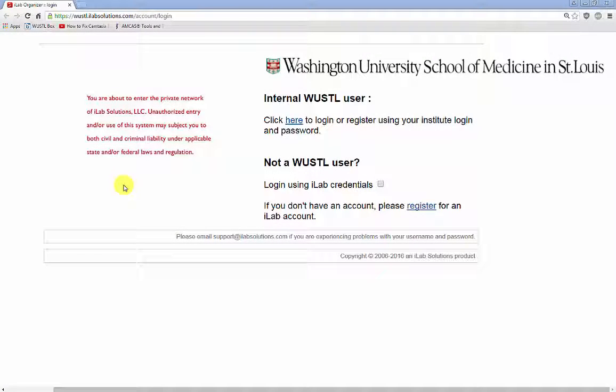Hello everyone, and welcome to another tutorial on our iLab at MIR series. And so in this video, this is our step 2 of the registration process. And in our step 1 of registration process, we kind of went over what it requires for someone to enter when registering for the first time. And so we had gone over clicking here and choosing your PI and so on.